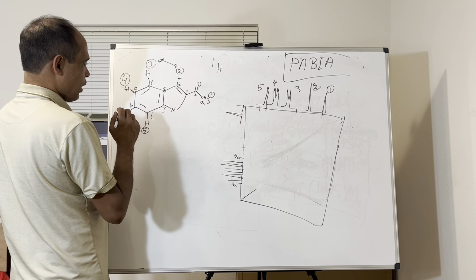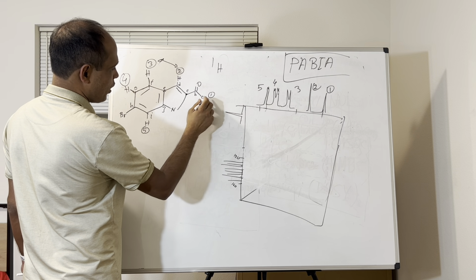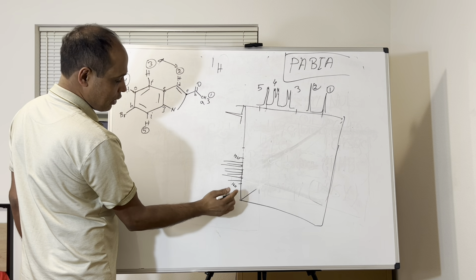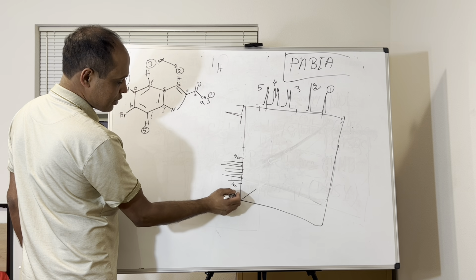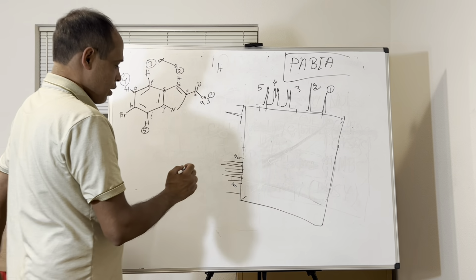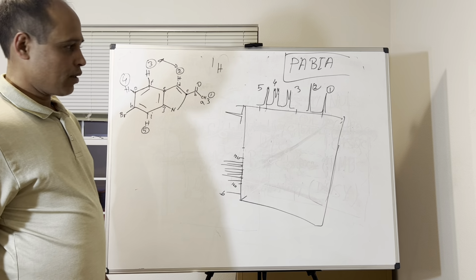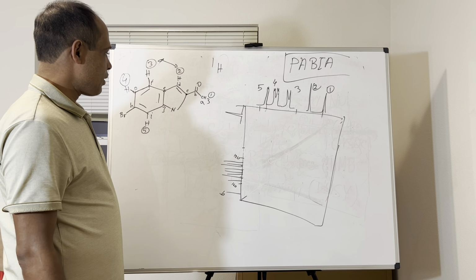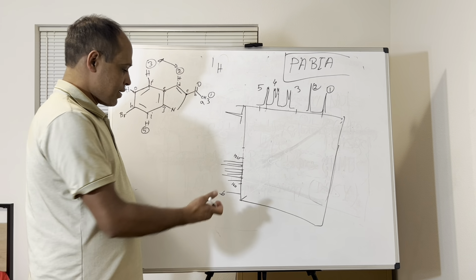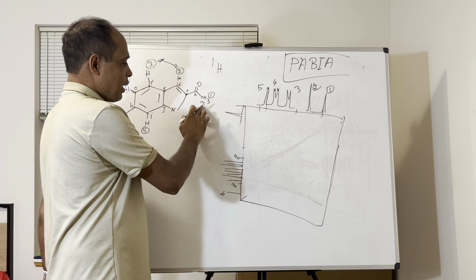Okay, and now only one carbon is outside, and any carbonyl peak will always show above 165. So suppose somewhere here. Only one carbonyl here, so you can easily determine it is B. And this B doesn't have any proton, right? Carbonyl doesn't have any proton, but A has the proton.